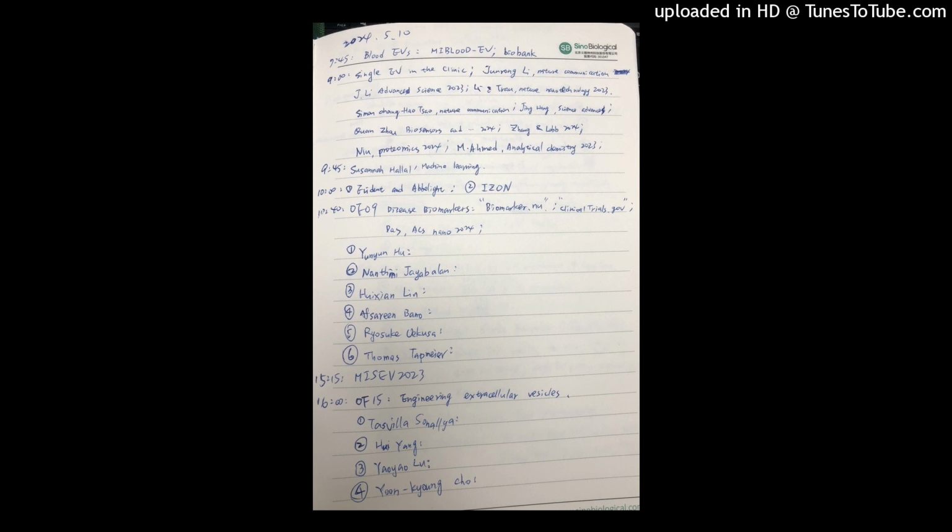And we have 2 candidates, and I'm sorry, the business development people tell me I can't tell you what they are, so maybe for now. And Natasha Borash, an honor student, did a nice Western blot on these. And the next student, Chloe James, then tried to use automated Western blot, then went back to traditional Western blotting, and you can tell that's not our favorite method. But we looked at sentinel positive samples and then whether or not the candidate is present in traces or not.